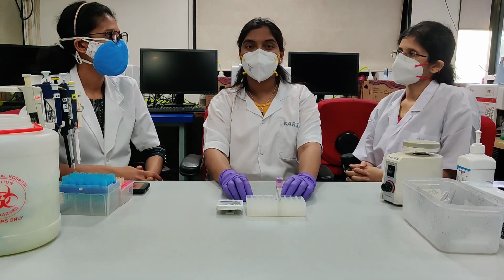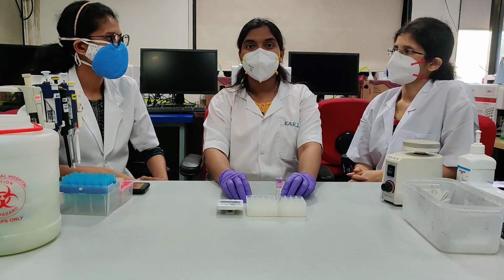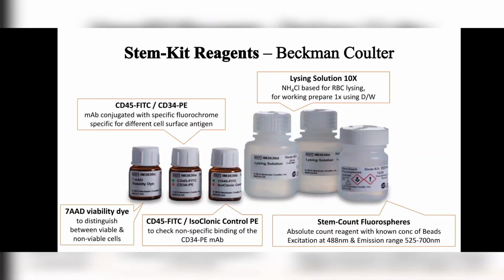Commonly used kits for CD34 stem cell enumeration are from Beckman Coulter and BD Biosciences. These are the Stem-Kit reagents provided by Beckman Coulter. The kit includes: 1.